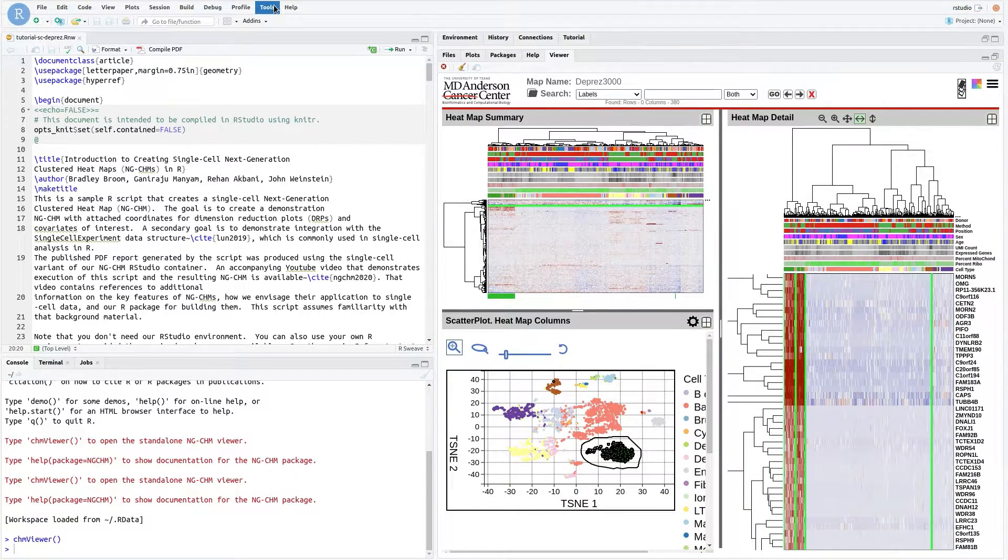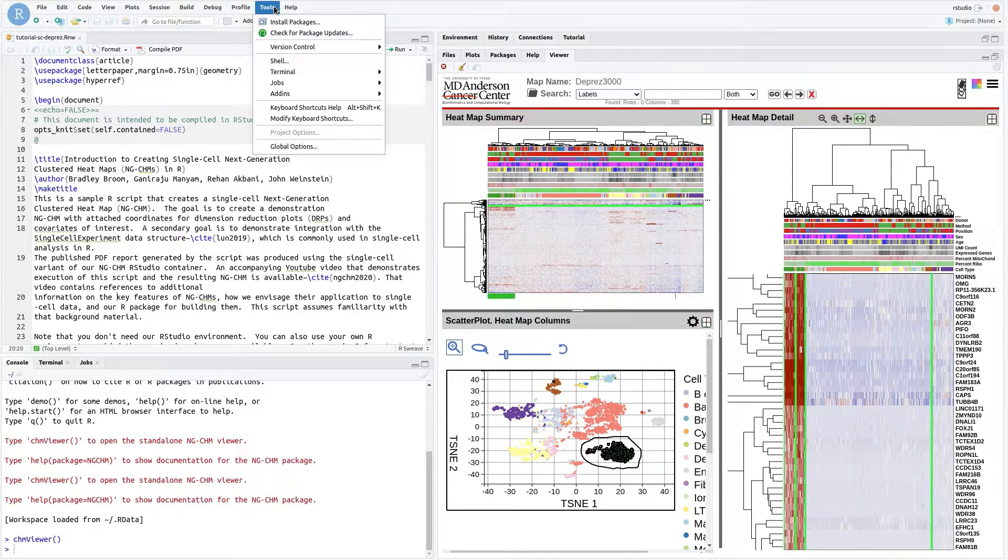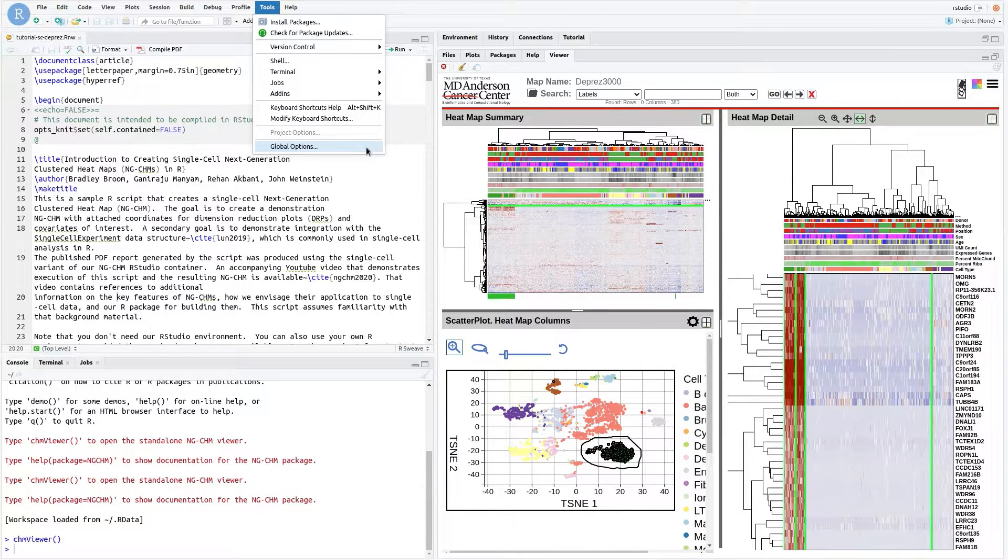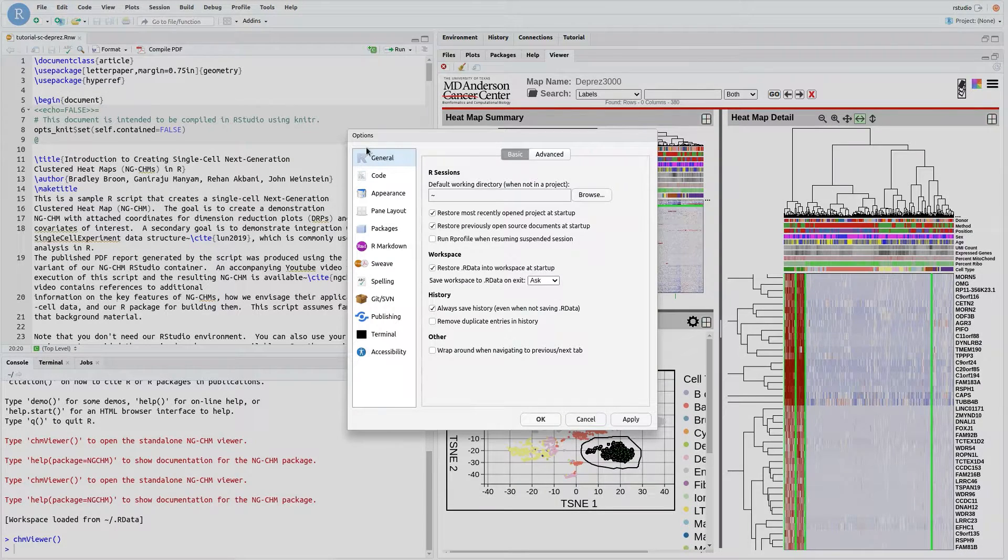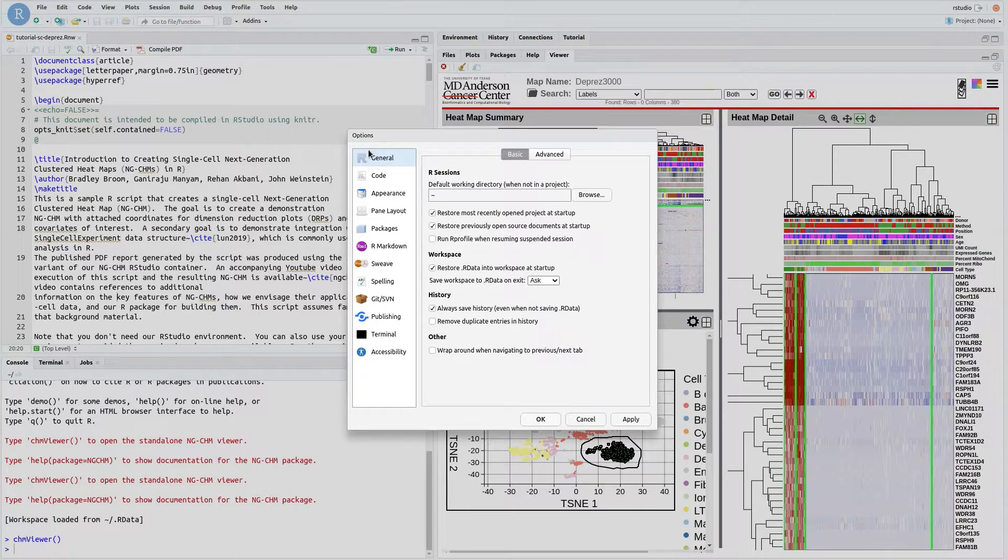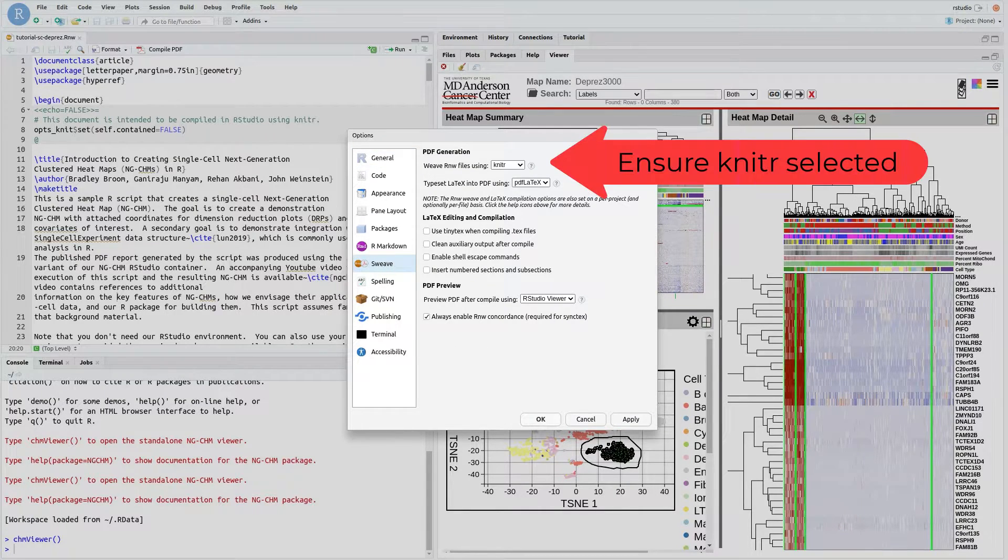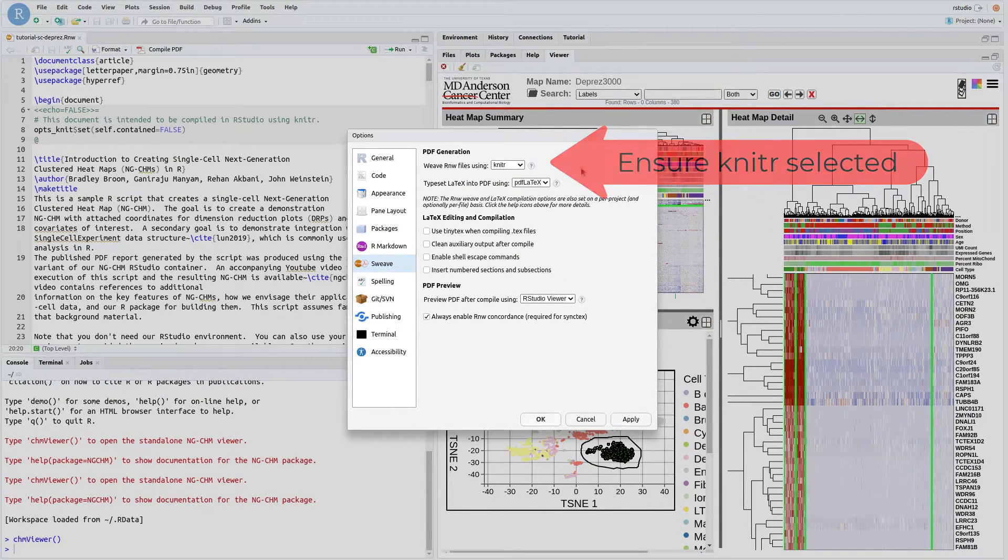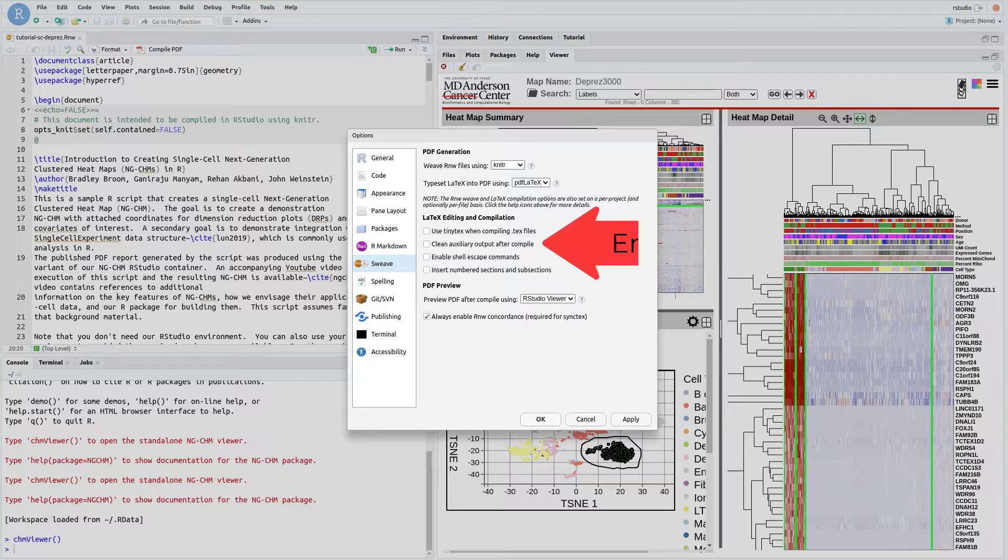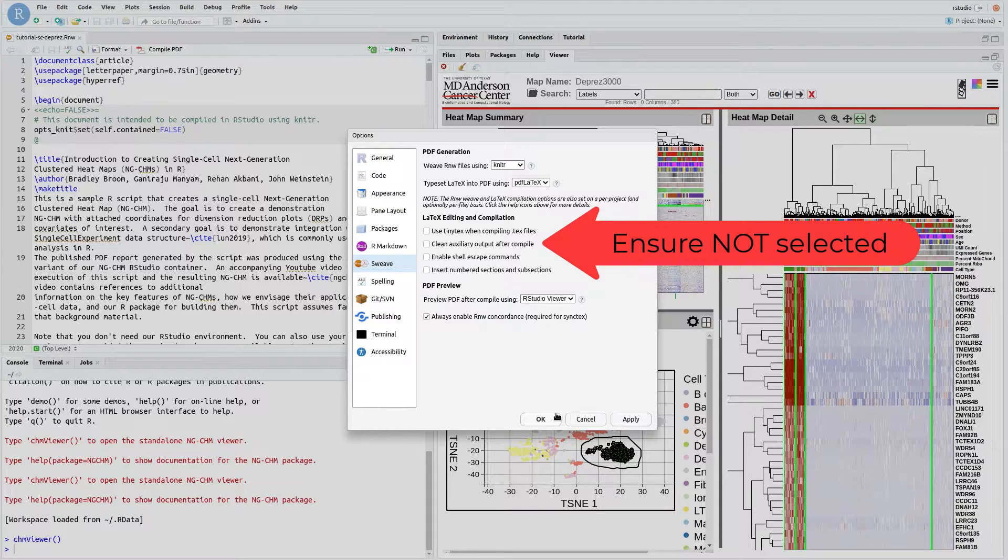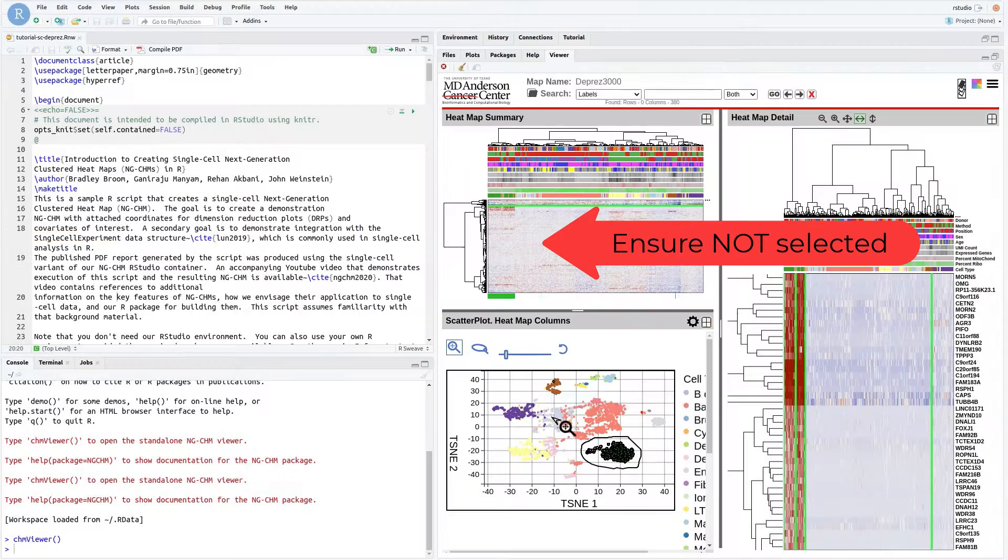To set up RStudio for processing the Knitter script, select the appropriate options dialog from the Tools menu, select the Sweave tab and check that Knitter is selected as the Weave tool and that the Clean Auxiliary Output checkbox is not selected.